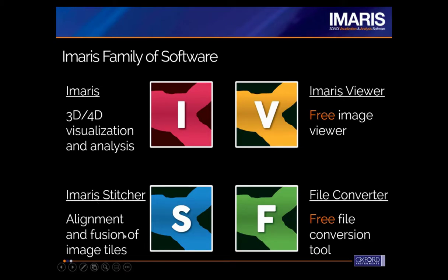Then the next one is Imaris Stitcher. This is software that you'd use if you have a very large specimen that you want to acquire images of at a high resolution. The problem is that to acquire at such a high resolution, the whole specimen doesn't fit within the field of view of your microscope. So you acquire many different image tiles, and then after the fact, you need to align those and fuse them into one image so that you're either presenting or analyzing just one image as a whole. Imaris Stitcher is built for that job, and it's nice and easy to use.